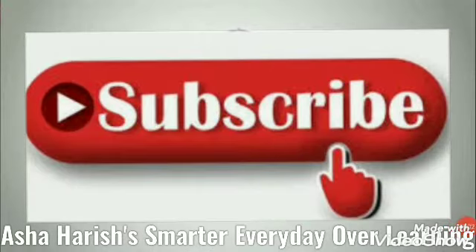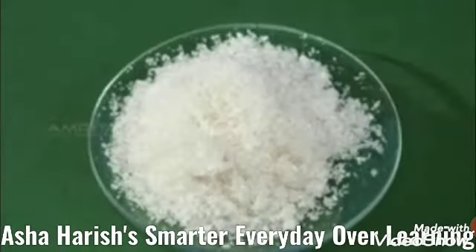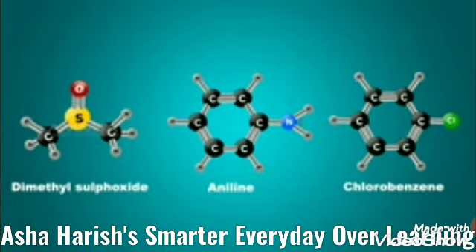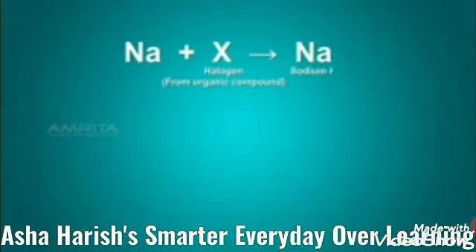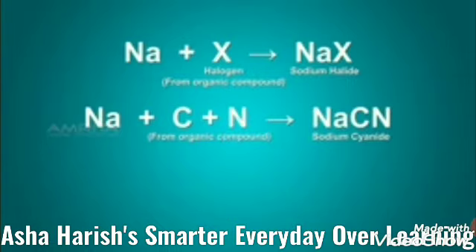Okay students, just by using this Lassaigne extract, we have to do the experiments to detect some halogens. Now let's see the preparation of Lassaigne extract. This is the organic compound we have to take for the detection of halogens, right? And students, this is the most reliable test for detecting halogens in an organic compound. In this test, the elements present in the organic compound are converted from covalent form into ionic form. And what are the apparatus you need to take for doing this extraction? This is the fusion tube, and these are the equations of sodium metal with halogens and cyanide also.